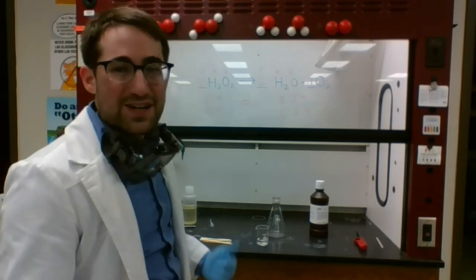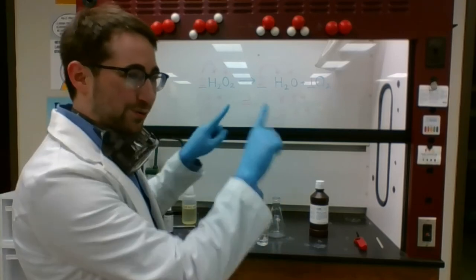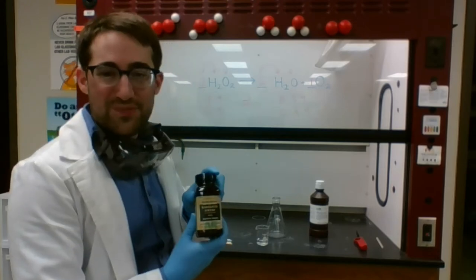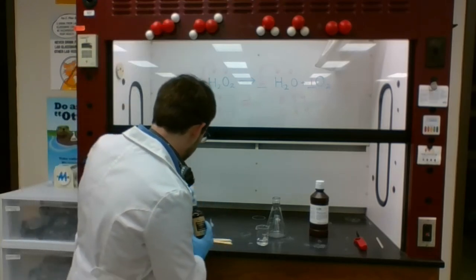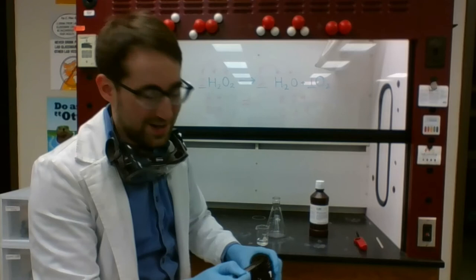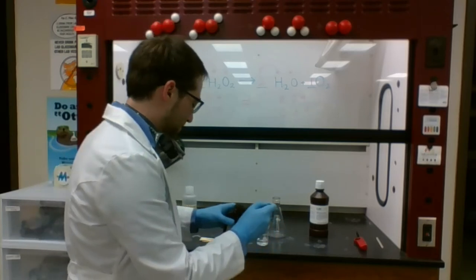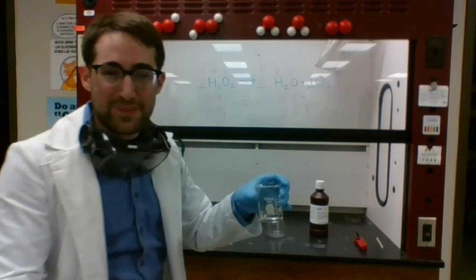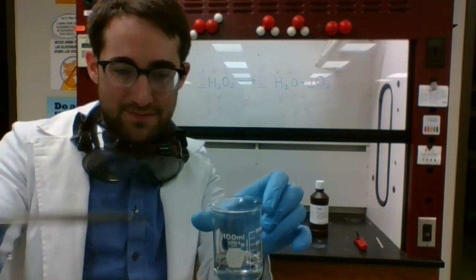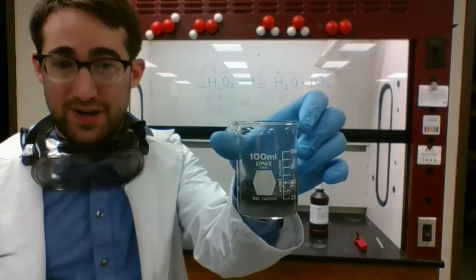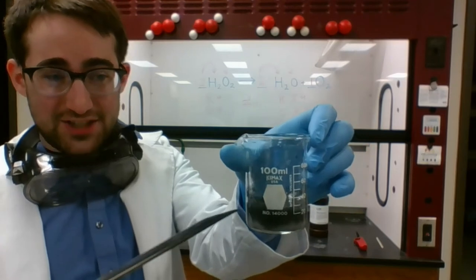One catalyst that we can use for this reaction is called manganese dioxide, or manganese Roman numeral 4 oxide, MnO2. It's a black powder, or maybe a lightish gray, depending on how you classify your colors. So, if I add this into my beaker of hydrogen peroxide, I should see it decompose a lot faster into the water and oxygen gas I should get. Here we go. Okay. We got some fizzing, which is good. So, that's the oxygen gas being released.